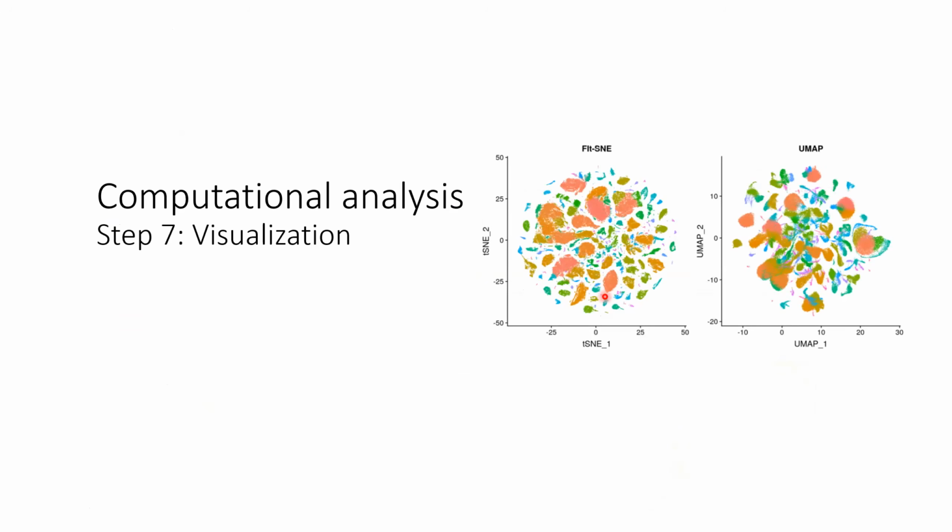Okay, so for the elbow plot, is it best practice to take your number of PCs right at the elbow of the graph? So at that slide, I think it was about 5 or 6. And yes, this is recommended, to take the number of PCs right at the elbow.